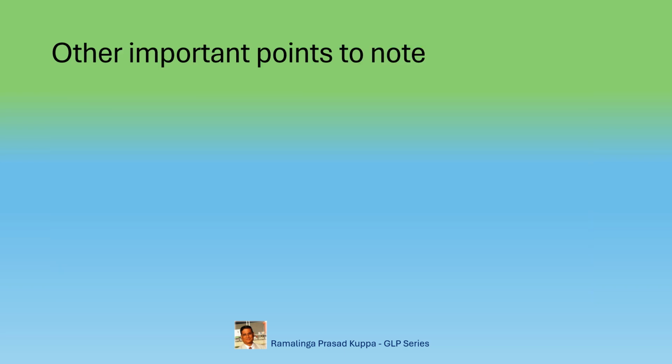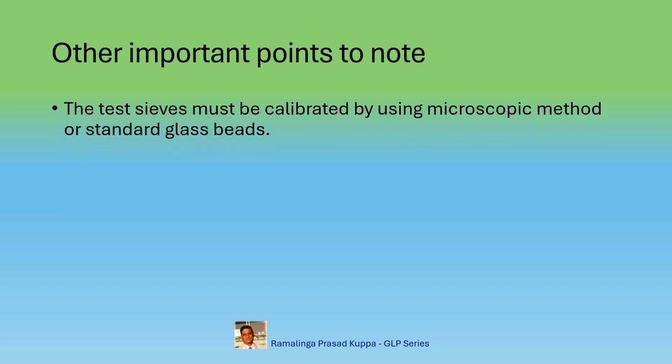Other important points to note. The test sieves must be calibrated using microscopic method or using standard glass beads. Standard glass beads of various sizes are available for calibration.